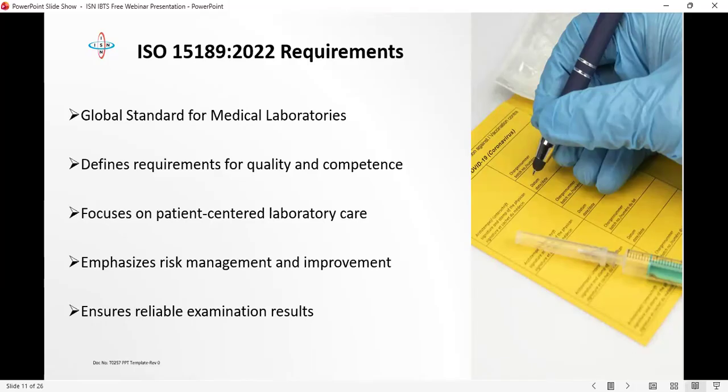You are drawing the sample. As you draw the sample, what next are you doing? You are processing the test. You did not have a protocol for the pre-analytical technician or phlebotomist or scientist collecting the sample to identify a patient. There is a requirement to prevent a normal person's result from being transferred to somebody who is sick, and the person is discharged.